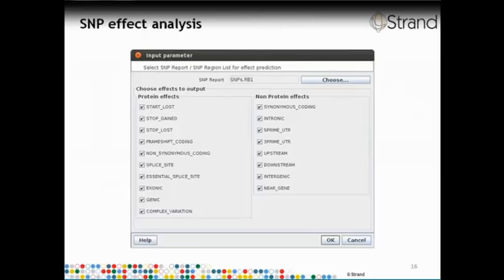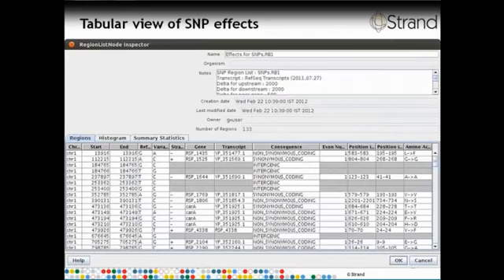Gs in the genome. So one question one might have at this point is to find out if a specific reference base is mutating into a C and if a specific reference base is mutating into a G. To do that, we can use the powerful visualization capabilities of the region list operation and overlay the color of the reference base. So what we notice now is that of all the bases changing into a C, there are almost equal number of A's, G's and T's which mutated into a C. Similarly, there seem to be an equal number of A's, C's and T's which mutated into a G. So in general, it seems to indicate that there is no particular preference for that mutation.